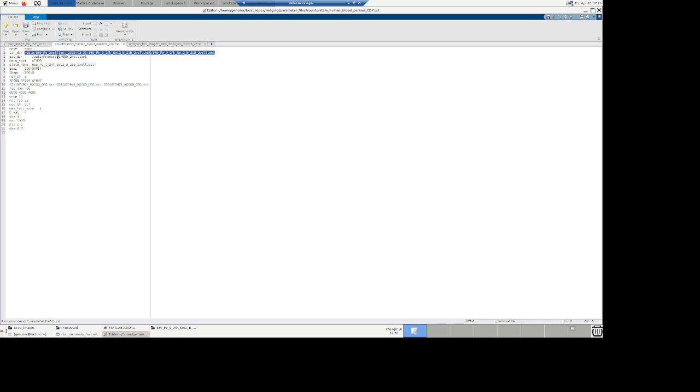Now it asks me for an output directory. Right now I've created one already. For demo purposes, I'm going to do toWell test demo. It will create this new directory, output. It's asking me the name of the plate. It's kind of redundant information, but in case someone saves the directory differently from the plate or the name of the images, that's the option here. You can change that. By the way, it's not tab delimited. All this is just using a space to extract the information.